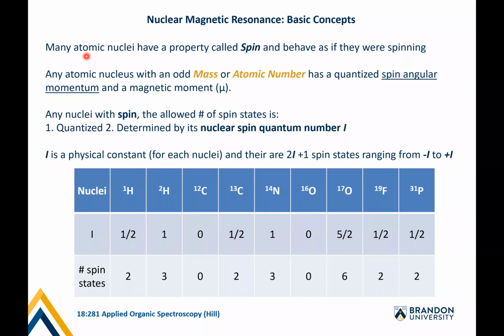and this is associated essentially with changing the spin of nuclei. So we're not even talking about bond energies for bonds moving or bending or anything like that, but it's just changing the spin of an atomic nuclei. So it's very low energy.